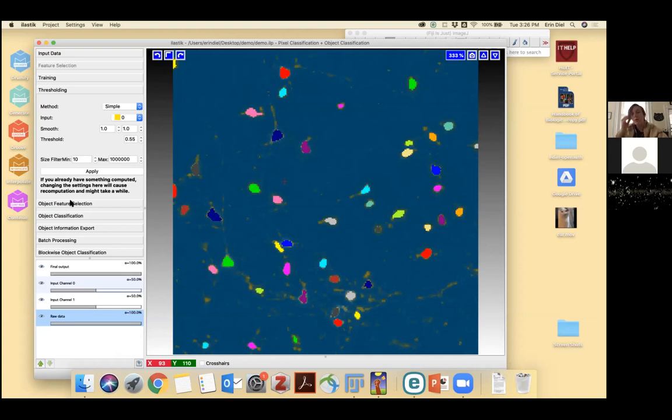And then we want to start classifying these objects, because right now I've found objects, but what if I wanted to say something about cell shape or cell size or cell intensity to classify them as particular instances? So for example, I don't actually know what this is an image of, but let's say these cells are expressing CFOS.